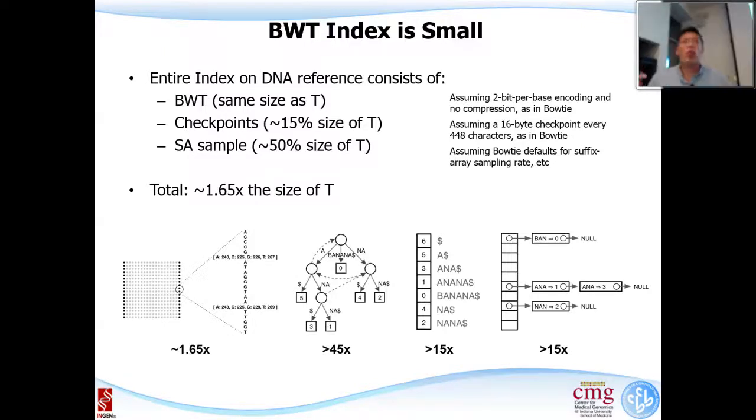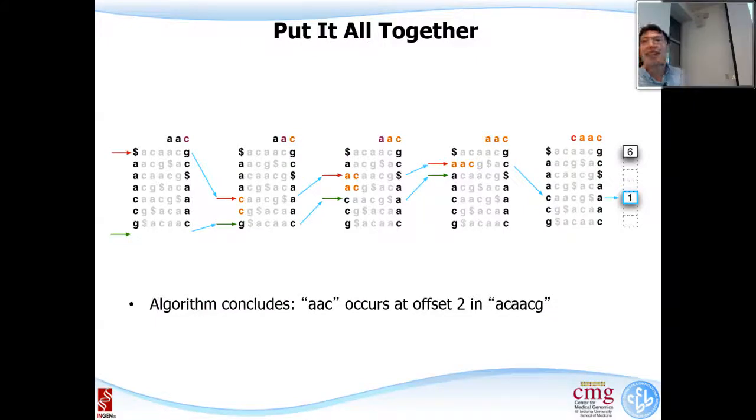There are 2 things we really need to be concerned about. The first one is the resource being used, which is how much memory you need to record, and the second one is the searching speed, right? So these are the 2 most important things for next generation sequencing data analysis. For this particular method, if you think of how much memory is needed, this reference sequence and the BWT converted original reference is the only thing you need, right?